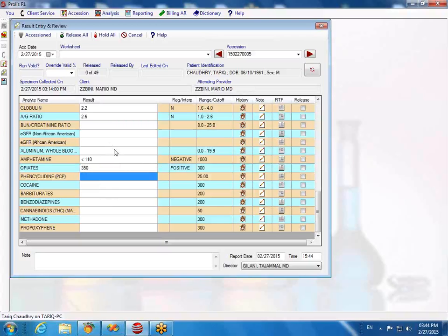It did positive. Okay. All right, now let's go to the next one and enter 10. Let's see how much. We got 10. It will take 10. But it didn't change, so it will take 10 because the sensitivity is 10? It must be 10 or lower even.